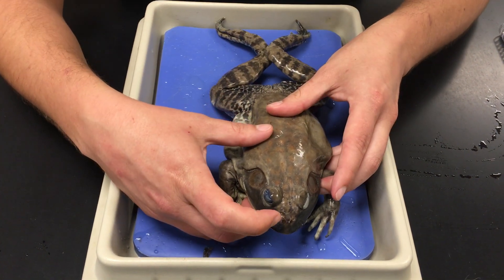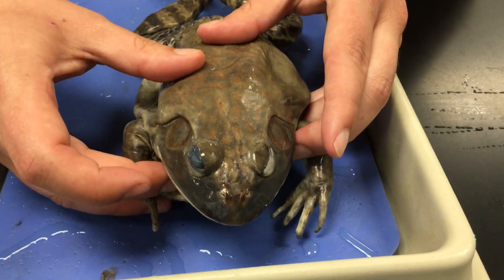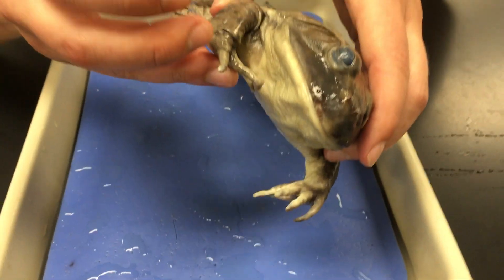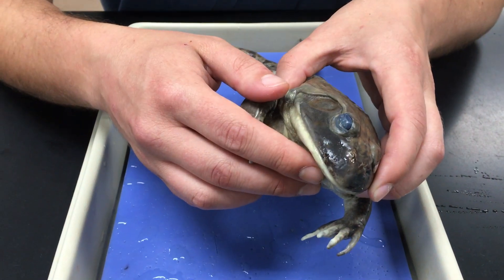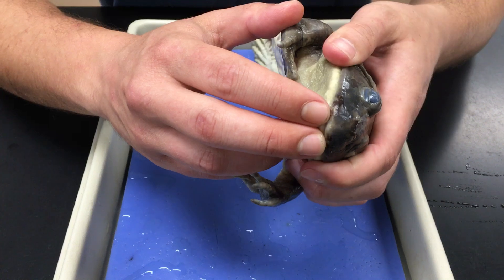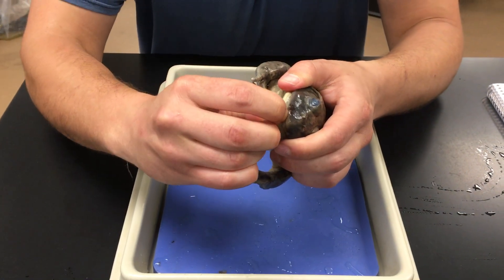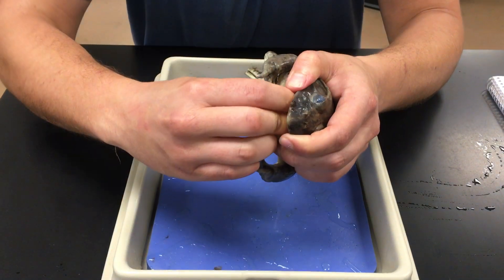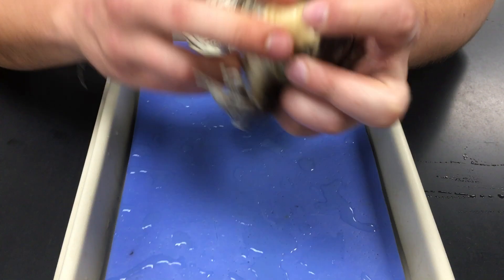Next, looking at the face, we have the nares — those are the nostrils of the bullfrog. Now let's look at some internal features associated with the mouth. In order to do this, you have to kind of snap the jaw open. Now that we have the jaw open, it exposes several structures that we can look at.